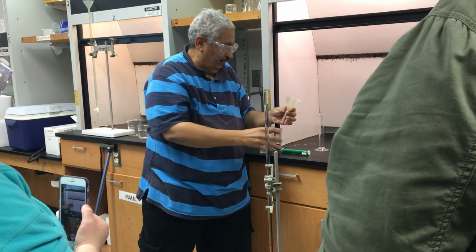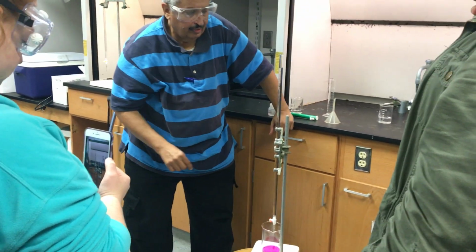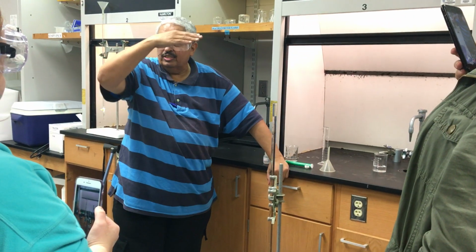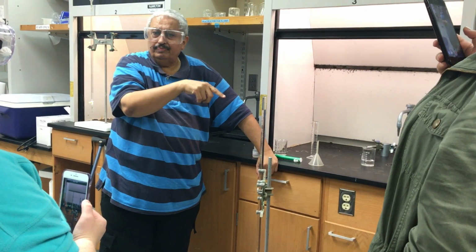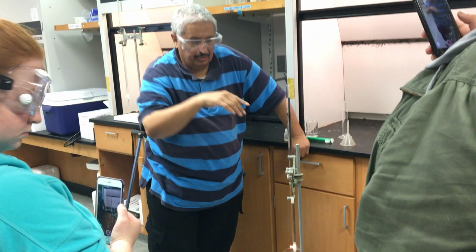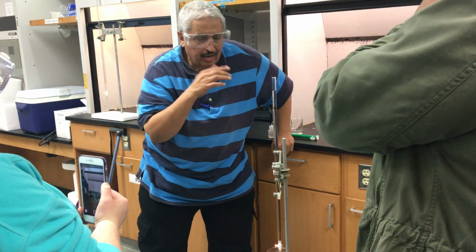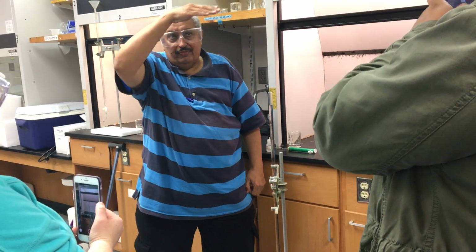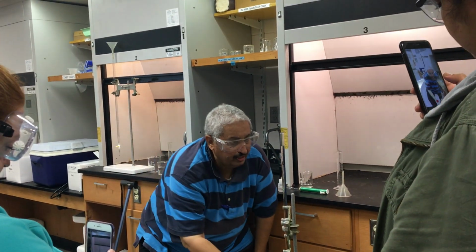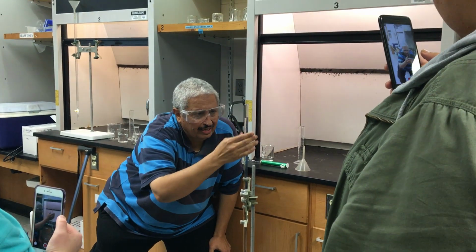Now it looks like it is above 0, so I have to lean myself up so my eyes are perpendicular on the meniscus inside the burette. It has to be 90 degrees perpendicular to the meniscus. You see the meniscus here at the top? It's a little bit curved. So I have to have it above the 0, not on 0, but above the 0. So the meniscus is here, and I'm looking at this. So I have to lean myself down here and see where my 0 is. I can't see it very well.